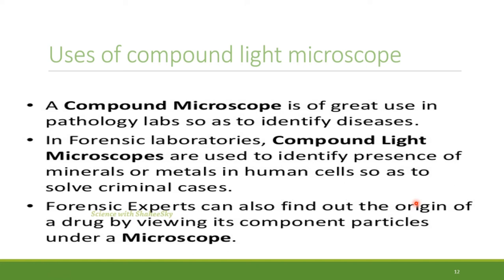Normally in the medical field, educational field and in research, microscopes are used to identify samples, cells, tissues. Even forensic experts can find out the origin of a drug by viewing its component particles under a microscope.